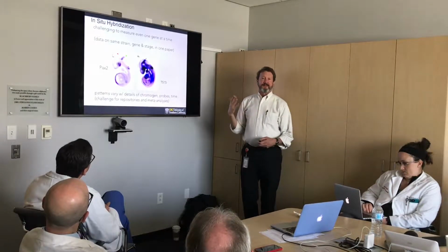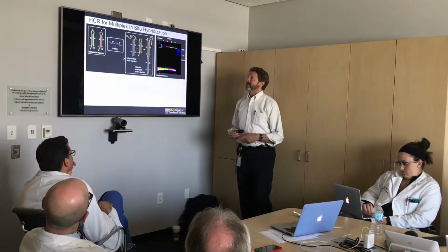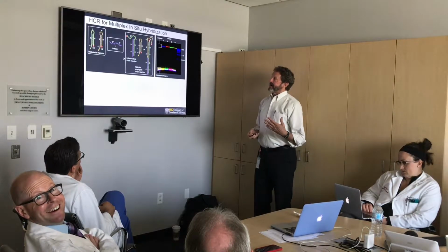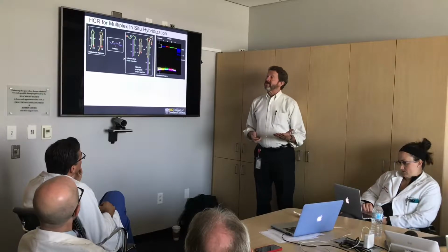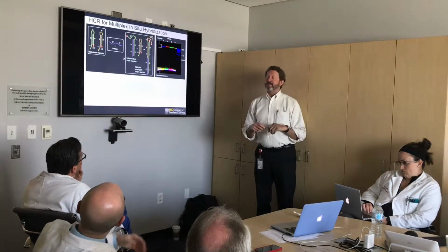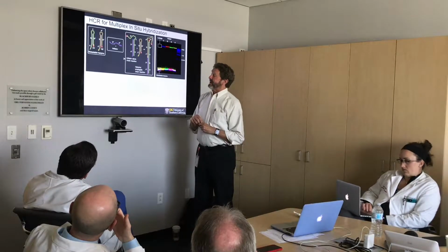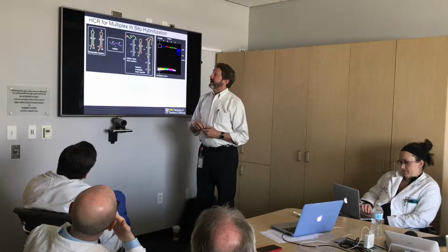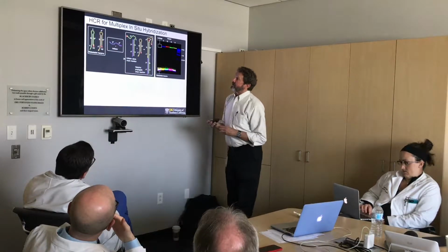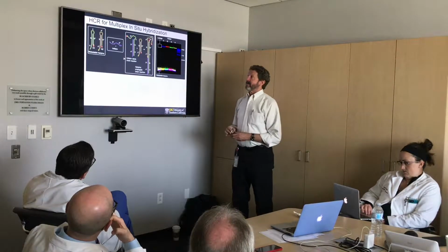So I would argue that this makes it hard to make a quantitative measure and to study covariance. And so a lot of our work starts from me complaining, and luckily when I was complaining in this case, it was in front of people that did DNA origami, trying to fold things up and make smiley faces or other shapes out of pieces of DNA. Niles Pierce and his colleagues at Caltech were working on hairpins, and we realized we could try to use some of their technology to make something that would give us a more linear gain.